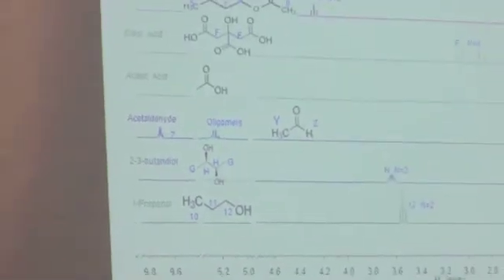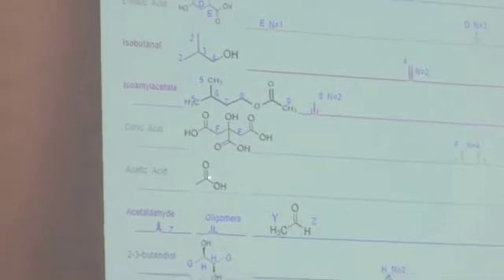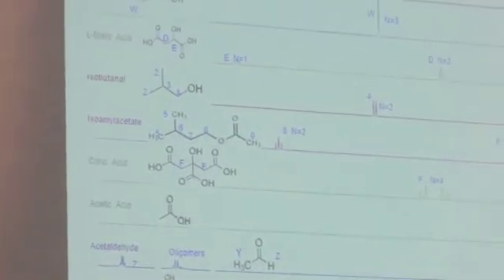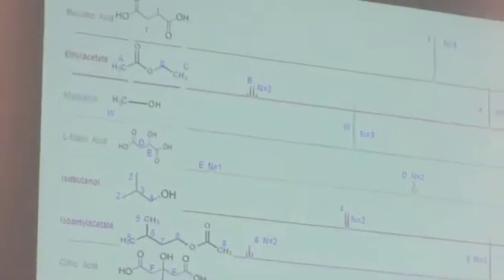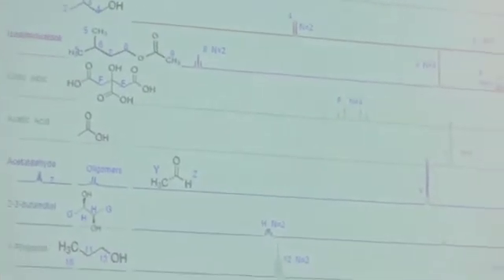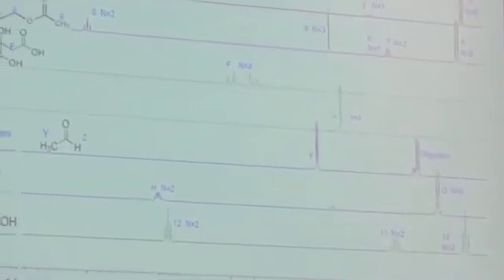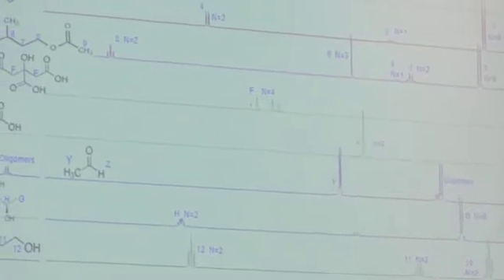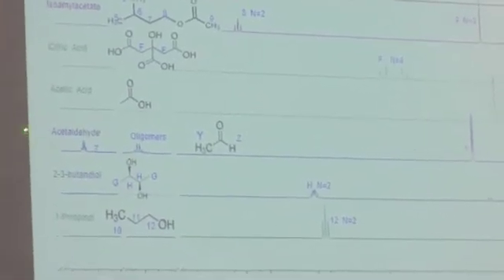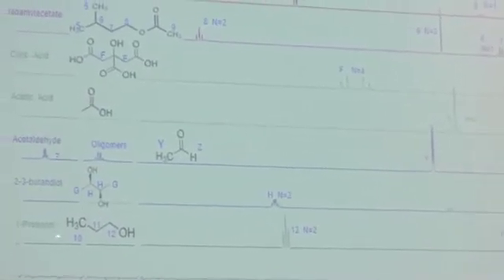Acetic acid shows up here as a singlet because the CH3 is next to a carboxyl group that this carbon here doesn't have a hydrogen on it. So it's not going to get split. It's not going to interact with the hydrogen on the next molecule. Acetaldehyde, unfortunately, reacts with water. So you think that it's like one kind of molecule, but when you put it in water, it reacts with the water and polymerizes on itself, and it ends up being a big mess. So you get all kinds of oligomers, which are polymers of acetaldehyde when you put that in water.